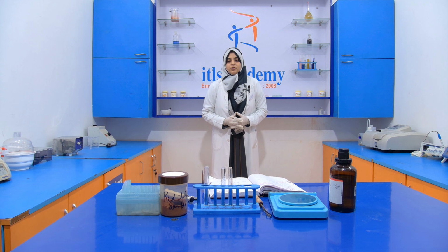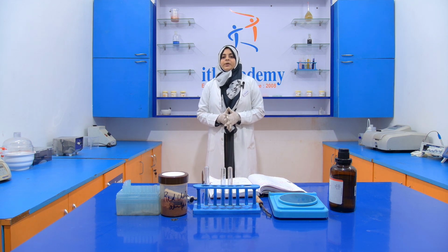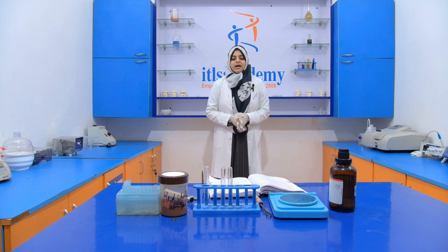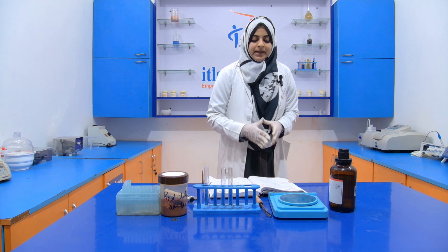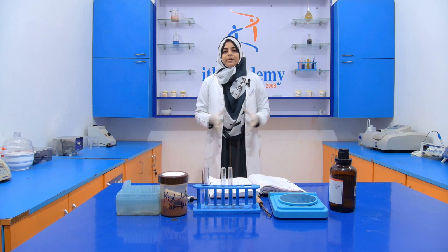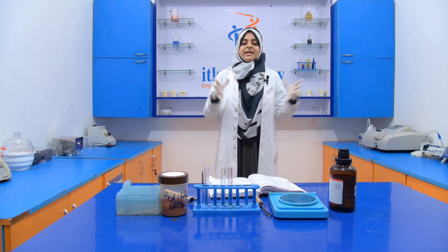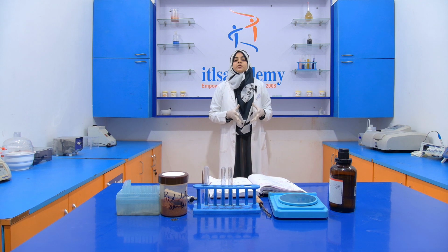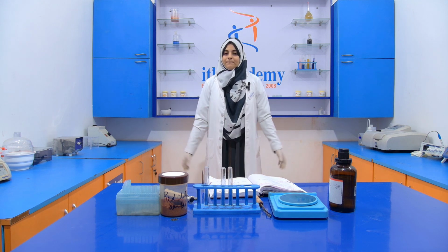Today we are going to perform another experiment in the adulteration series, in which we are going to detect rhodamine B in a chili powder. Okay, what do we have to detect? We have to detect rhodamine B in a chili powder. Here, the adulterant is rhodamine B and the sample is red chili powder.